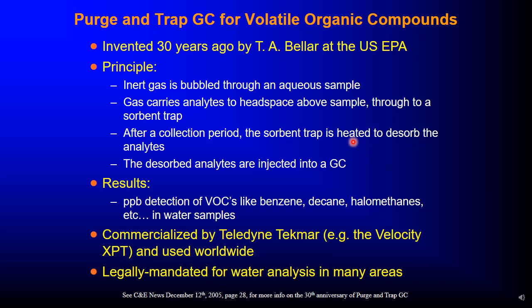The analytes are injected into a GC. Results: parts per billion detection of volatile organic compounds like benzene, halomethanes, etc. in water samples. It is commercialized by Teledyne Tekmar and others, and used worldwide. It is legally mandated for water analysis in many areas.